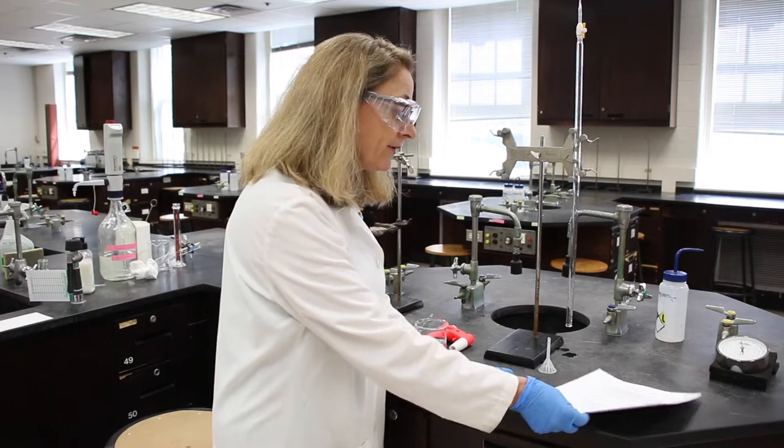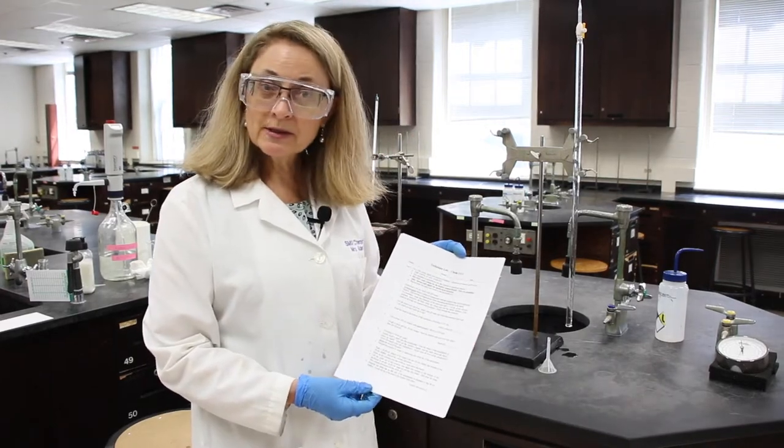Hello, and welcome to CHEM 1113 lab. Today we're going to be doing the technique lab for 1113. I'd like you to be my lab partner. We're going to follow along with the procedure that's been given.